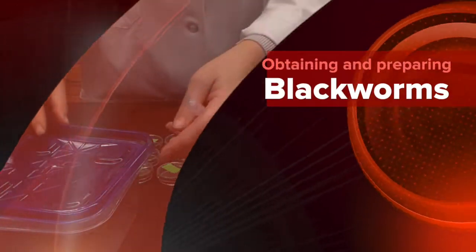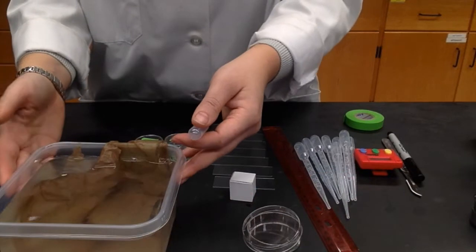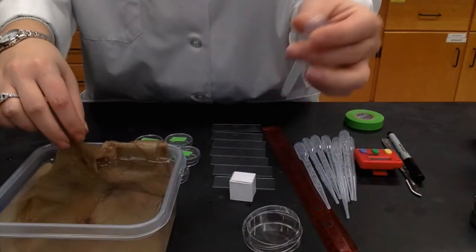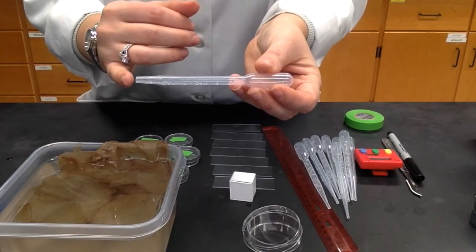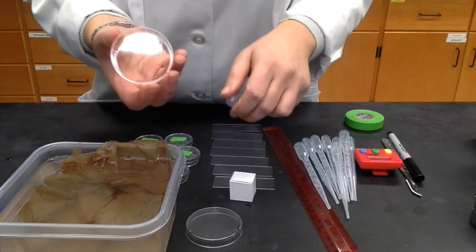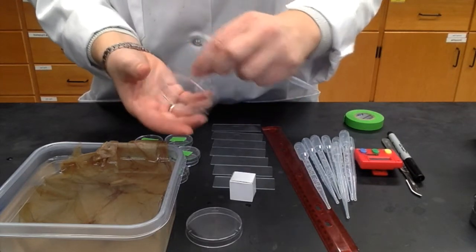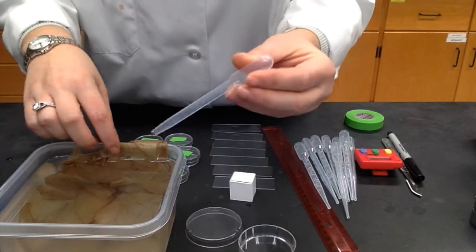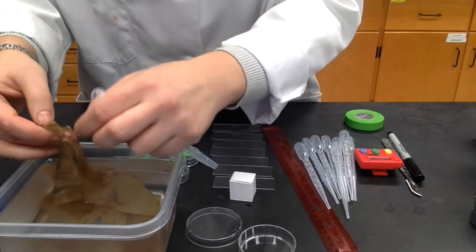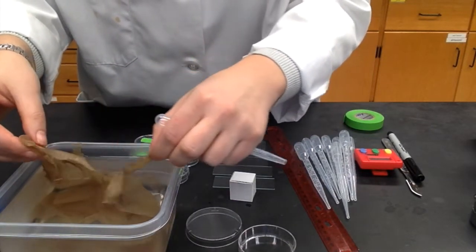This video will show you how to prepare the blackworms for the neurotransmitter lab. The blackworms will be in a container with a paper towel. You'll use a transfer pipette that's been cut so it has a wider mouth and your larger plastic petri dish. Go into the container and gently move the paper towel so that way you can access the worms.